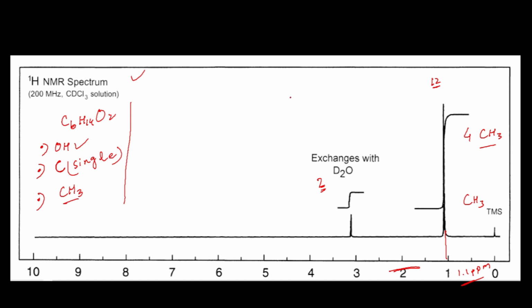So it is simple. If you start here and attach the methyl group, we cannot attach 4 methyl groups to the same carbon atom. And the other thing that we get from this peak is that all the 4 methyl groups have the same chemical environment. If they have the same chemical environment, it means towards either side the same groups are attached, like this.